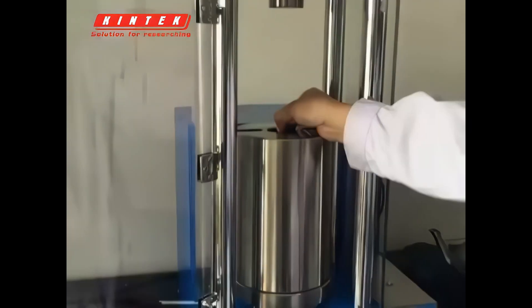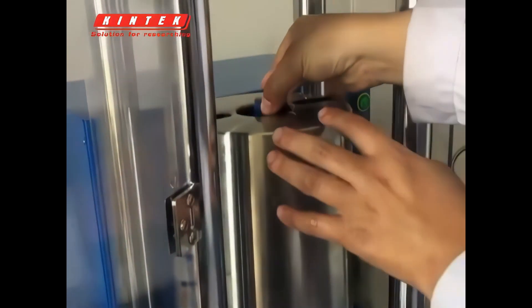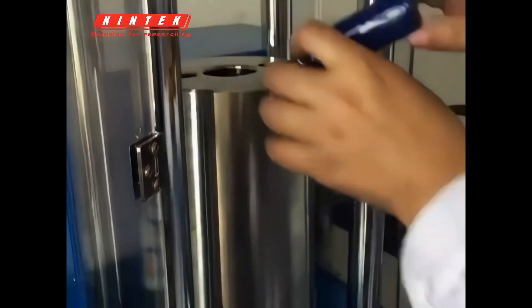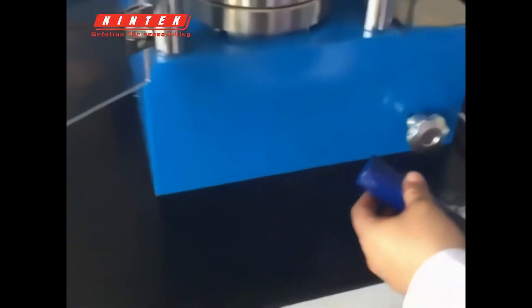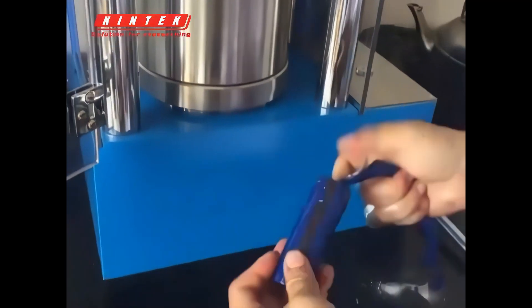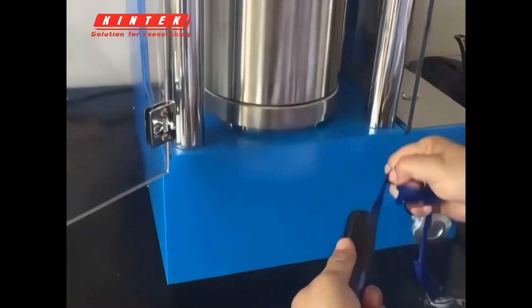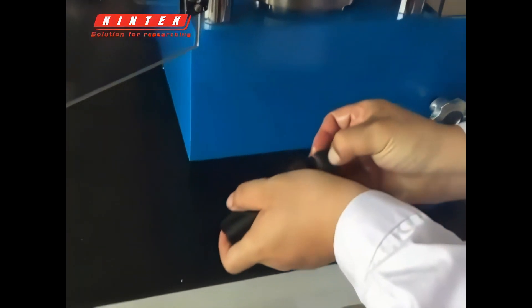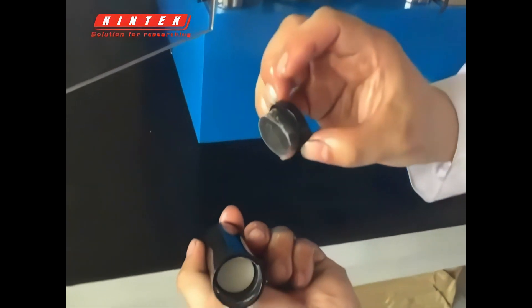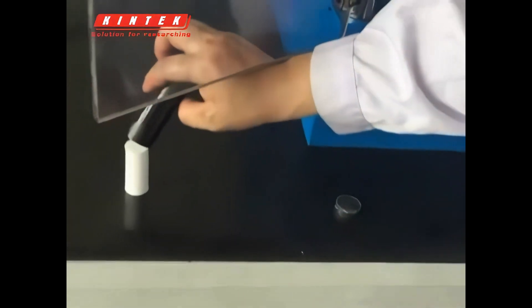Then take the sample. Open it and have a look — inside is dry. Nice sample. It's a cool result.